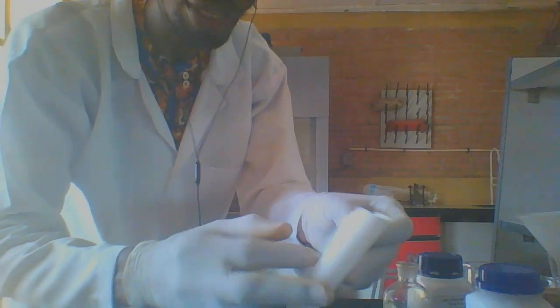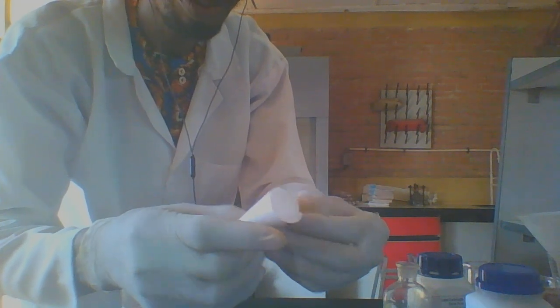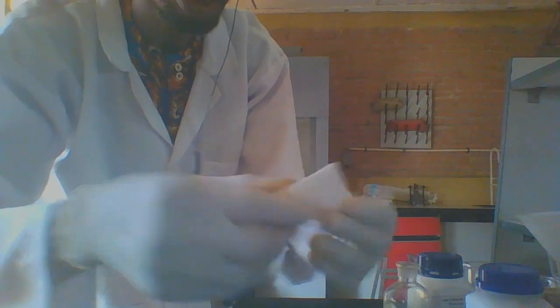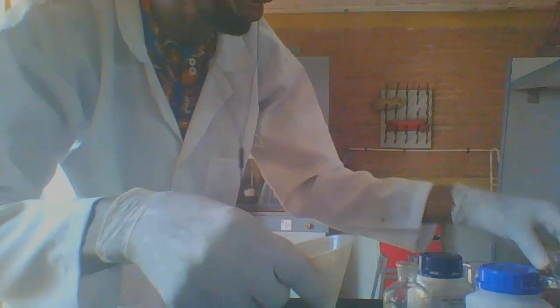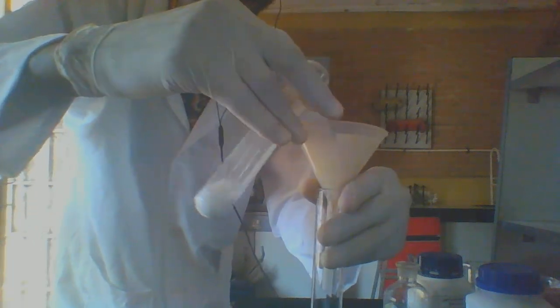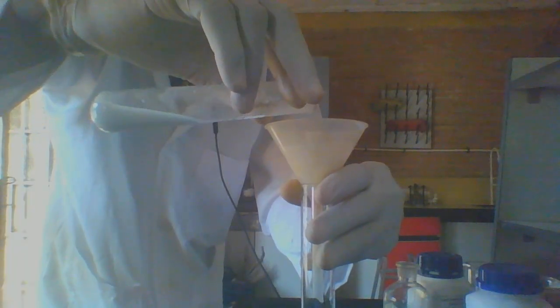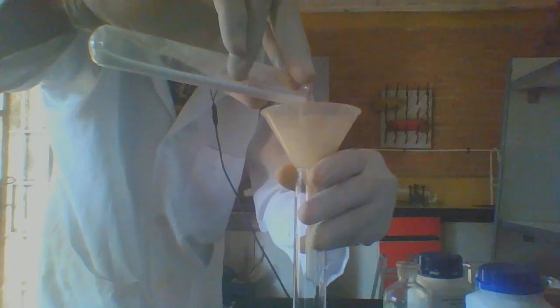So the next is to filter. I prepare my filter paper. I have my funnel already, like a cone, and I insert it here. Then I filter this mixture, to which I've already added nitric acid. You know, the starch is still there. And what you should actually have now is lead(II) trioxonitrate(V). That should be the filtrate.